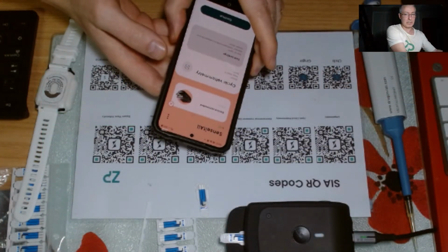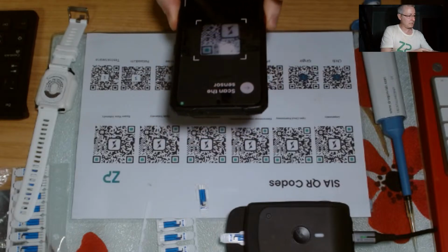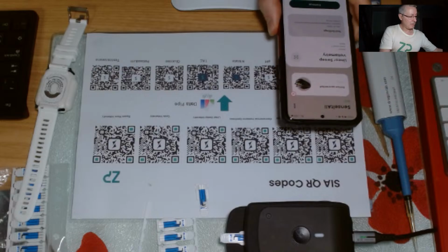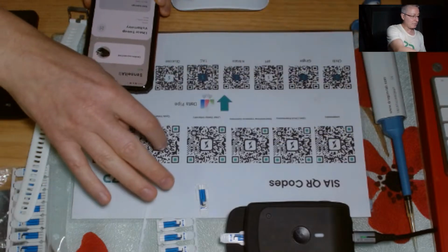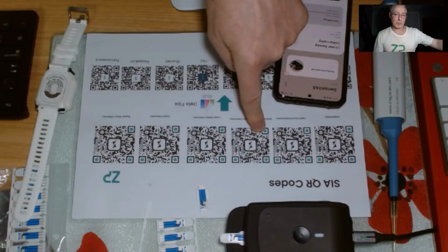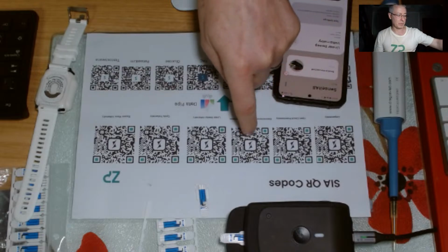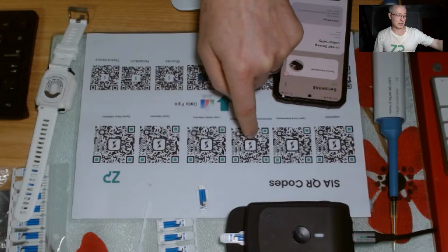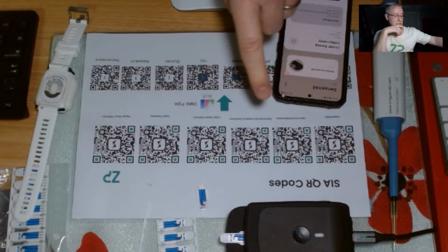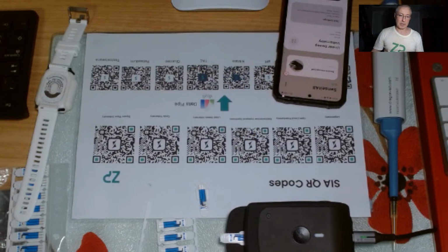So I've got this in cyclic voltammetry at the moment. I can put it into linear sweep voltammetry. So we do have square wave, cyclic voltammetry, linear sweep voltammetry. A technique that sometimes complements square wave voltammetry and differential pulse voltammetry is impedance spectroscopy. This is an interesting technique. You could argue sometimes it's too sensitive. But that said, let me dive back to the slides now.